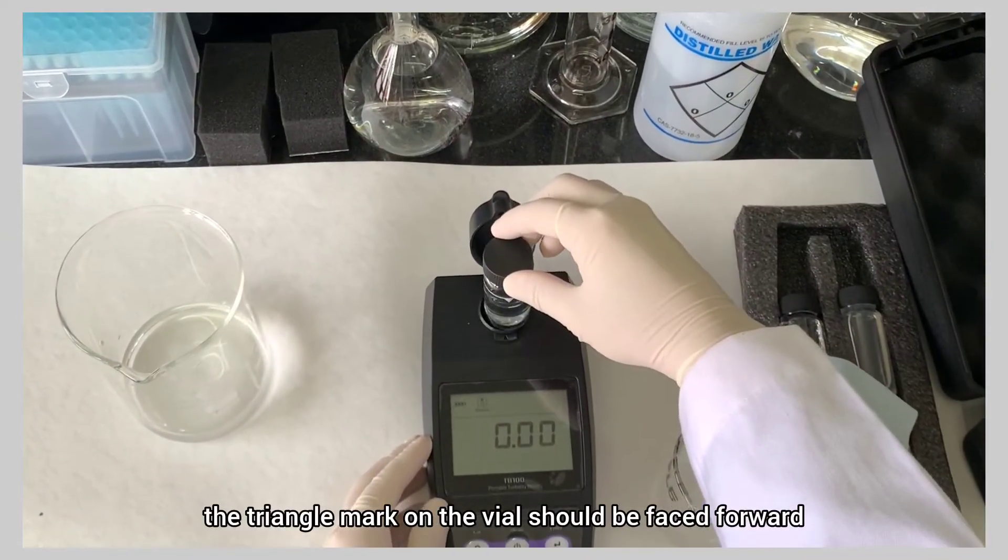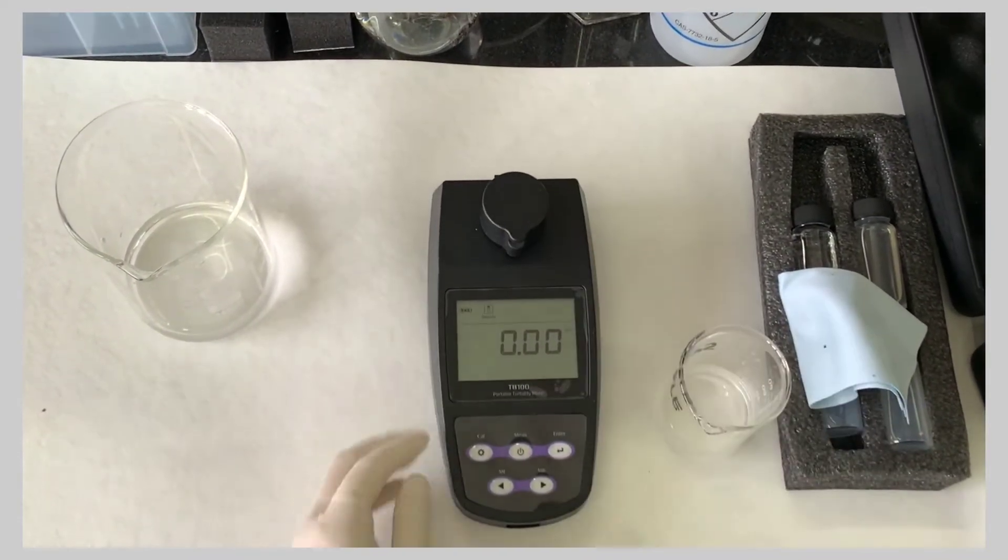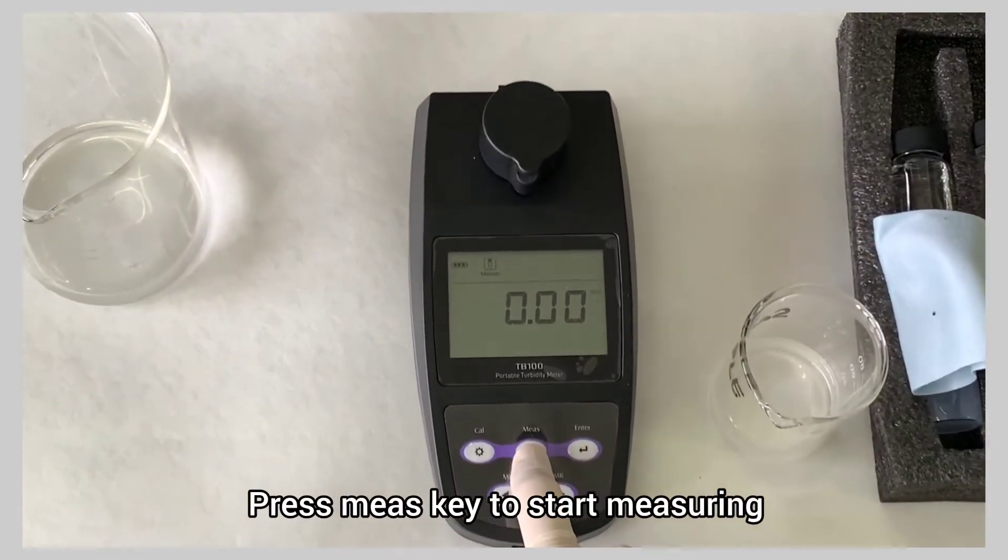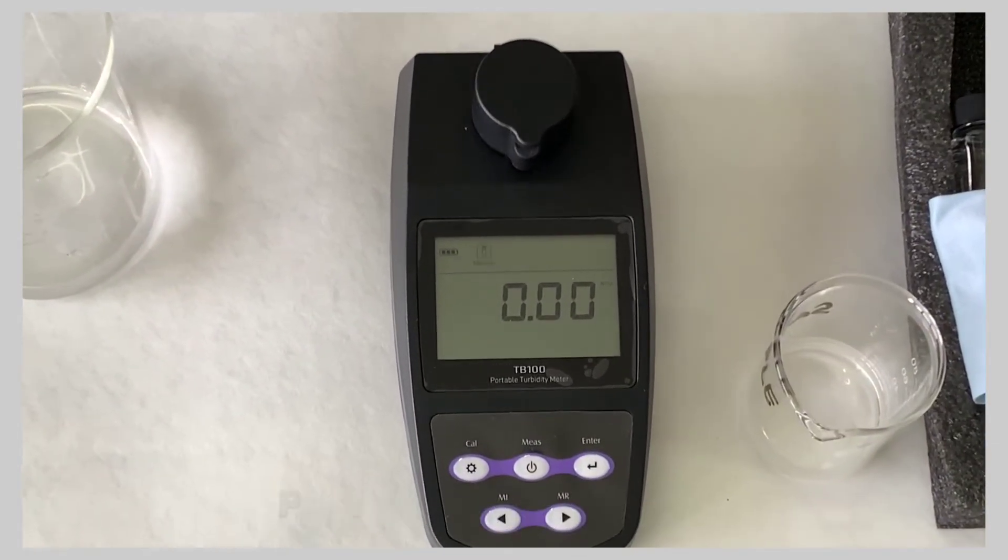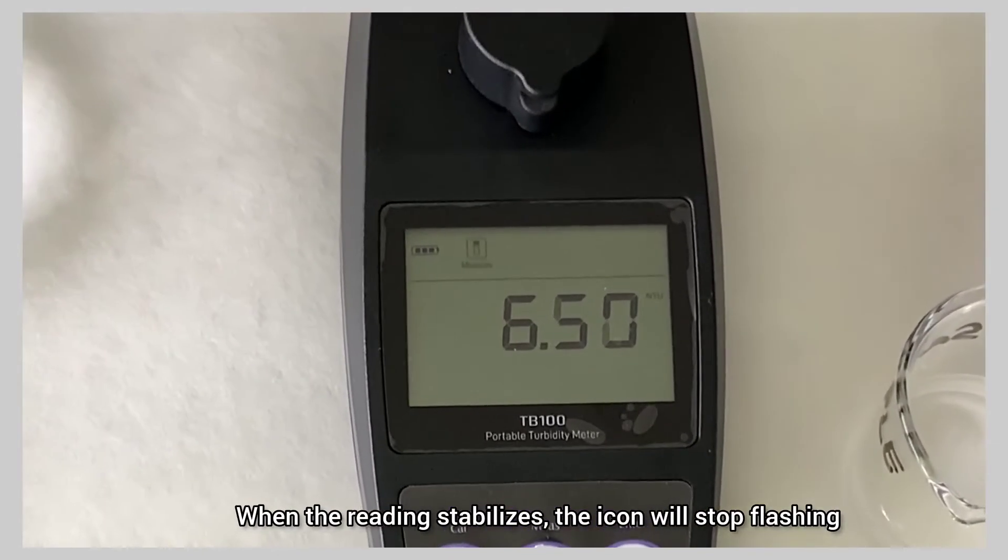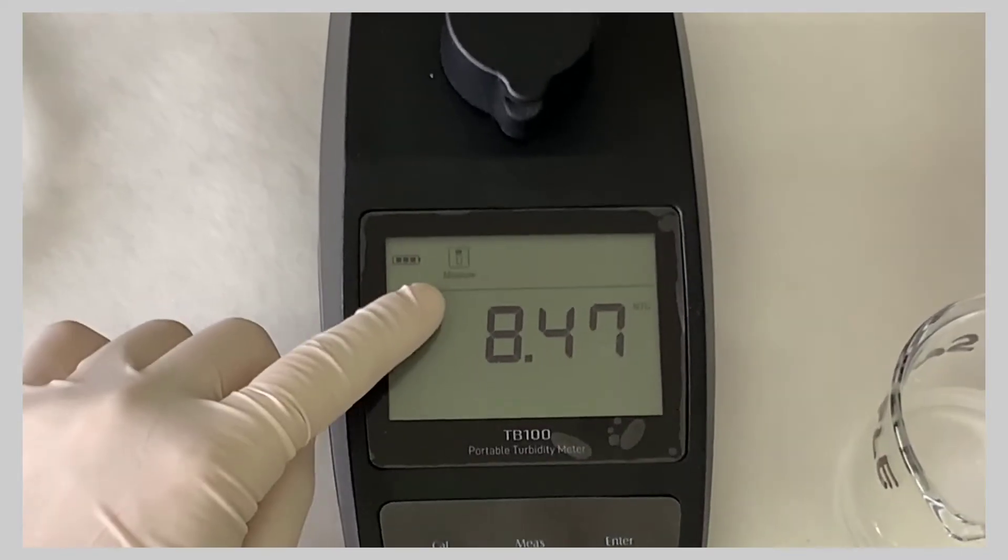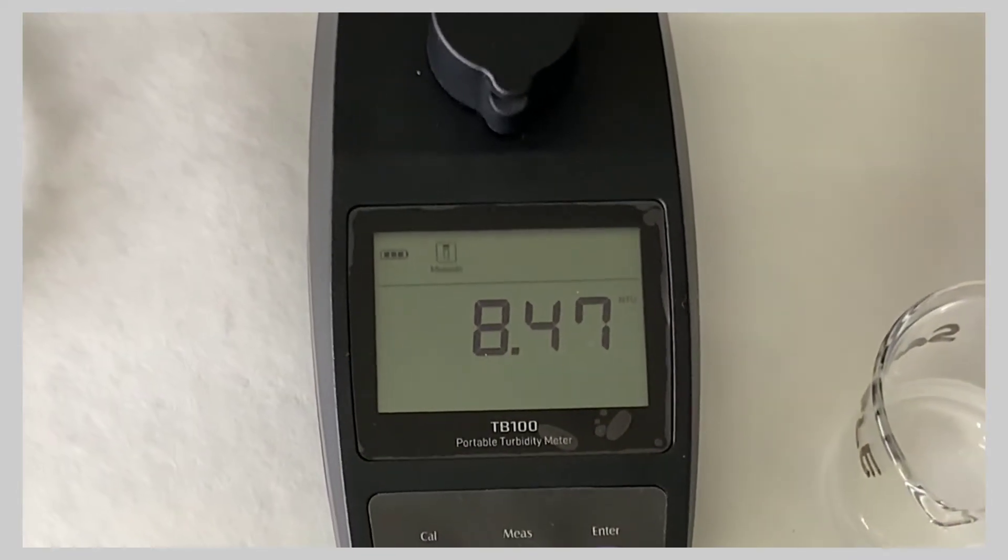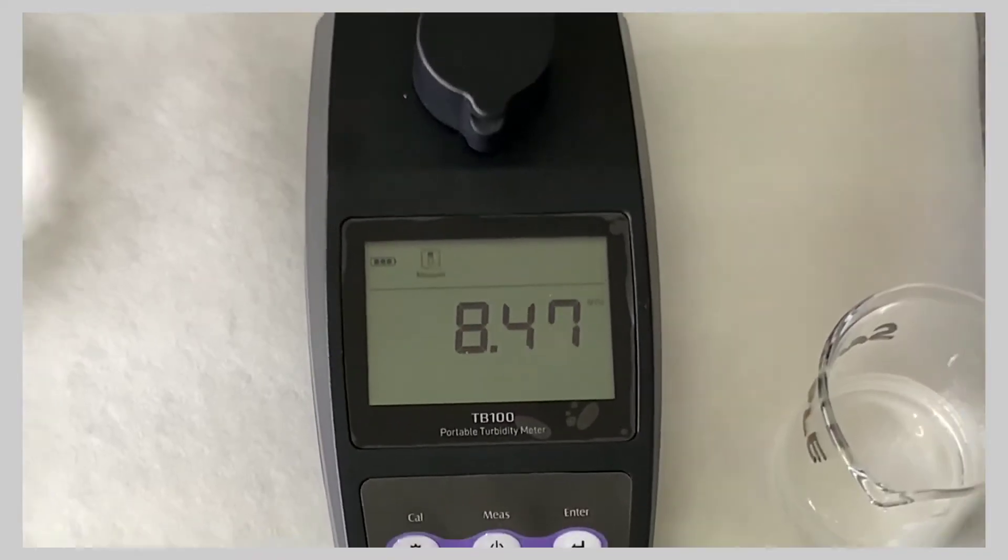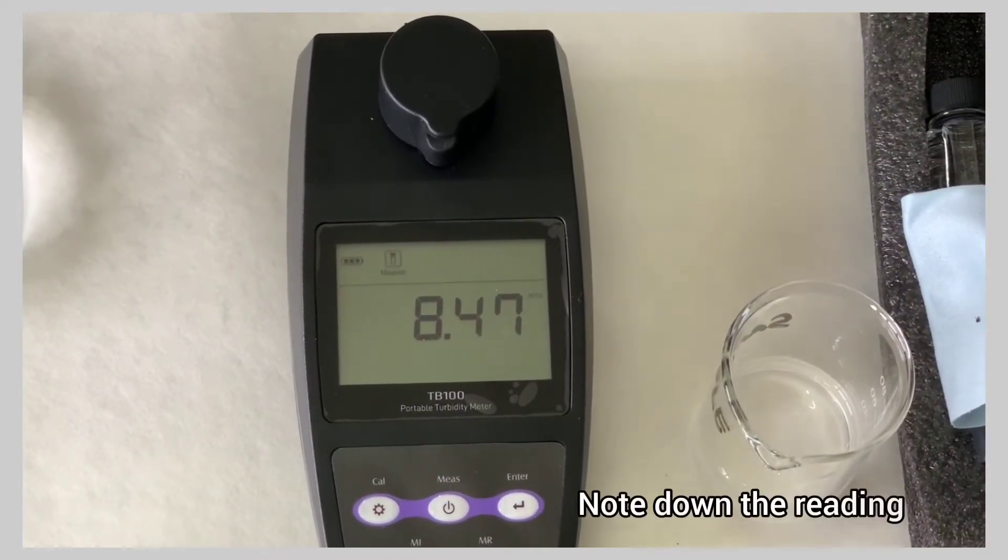The triangle mark on the vial should be faced forward. Press MES key to start measuring. When the reading stabilizes, the icon will stop flashing. Note down the reading.